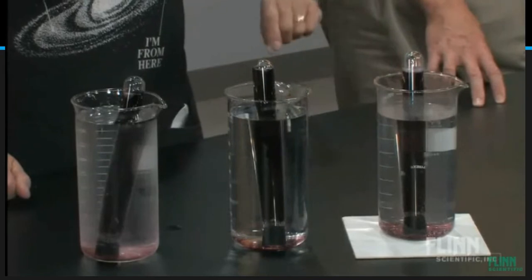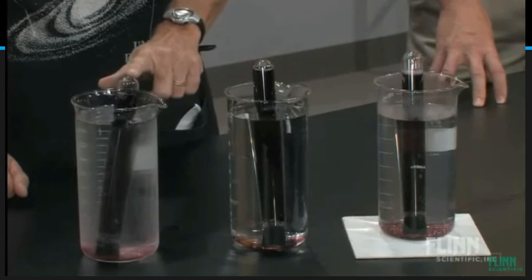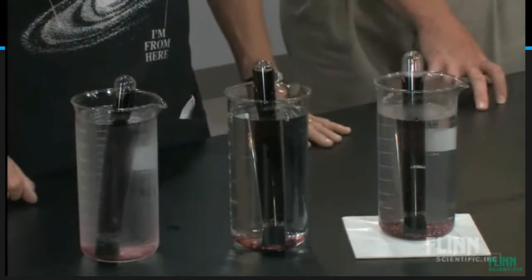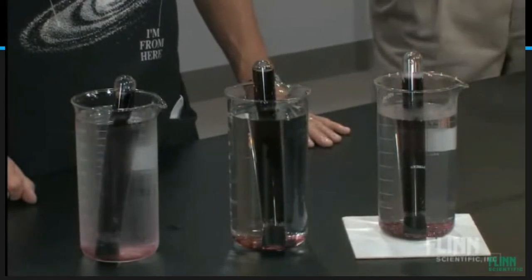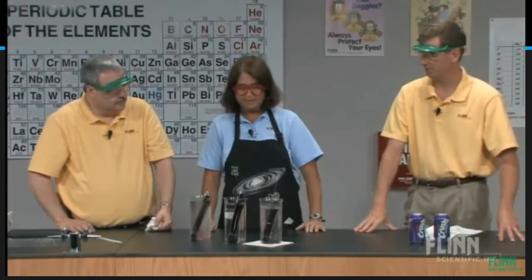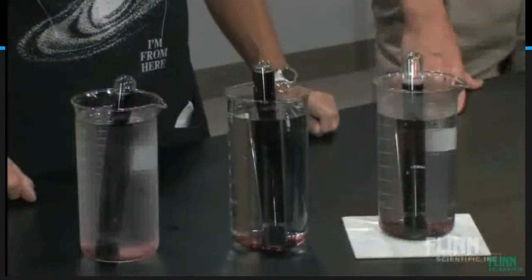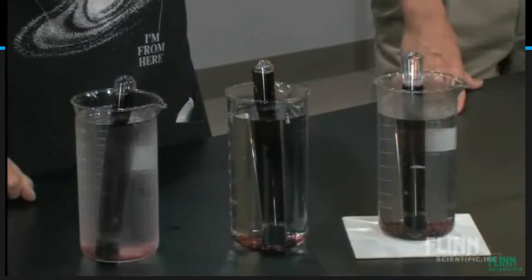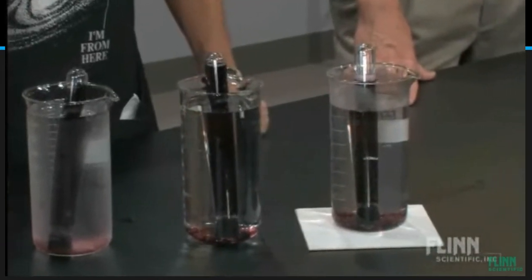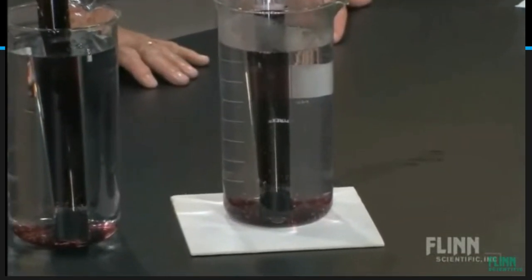One of the first things that you'd notice is going to be at the top of the test tubes. Now this one, for some reason, has got a lot more of the liquid. One of the things you want to make sure of when you fill the test tubes is that when you put the stopper in, the liquid overflows so you don't have a container of gas at the top to begin with. But as far as looking at the motion of the gases, this one's definitely moving a lot faster. When it's in the hot water, you can see the grape crush coming out of the bottom. You can see the level inside the test tube moving lower, lower, and lower.